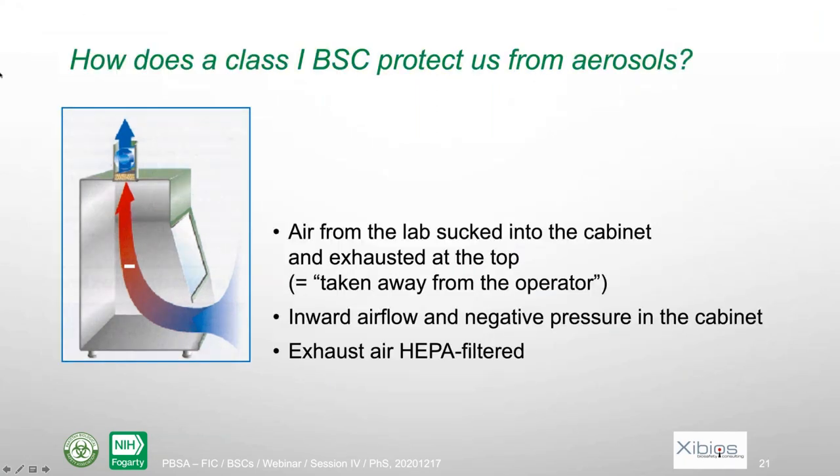So the first question was, how does a class one biosafety cabinet protect us from aerosols? And I think we already insisted. Very simple mechanism, you suck the air away from the operator, and then it's a HEPA filter. And so this is something which is extremely robust and protects you very well.